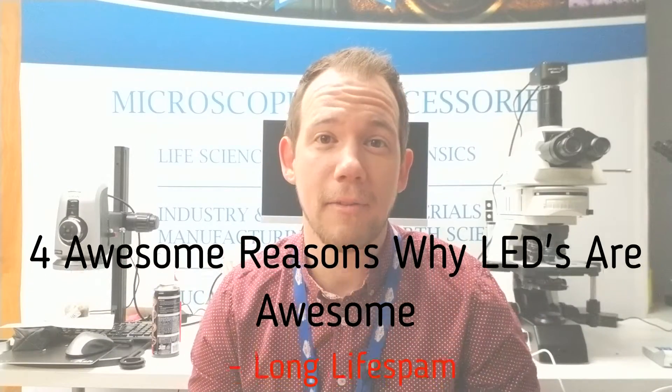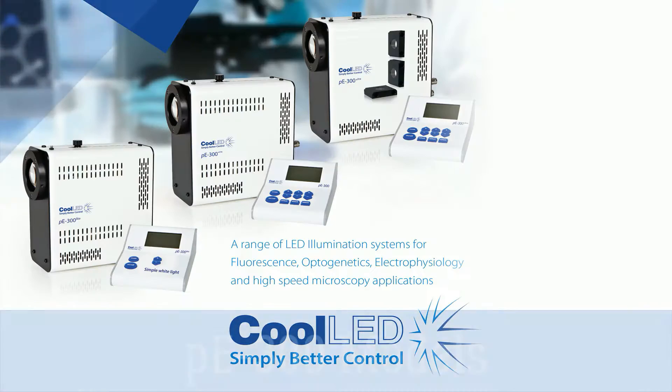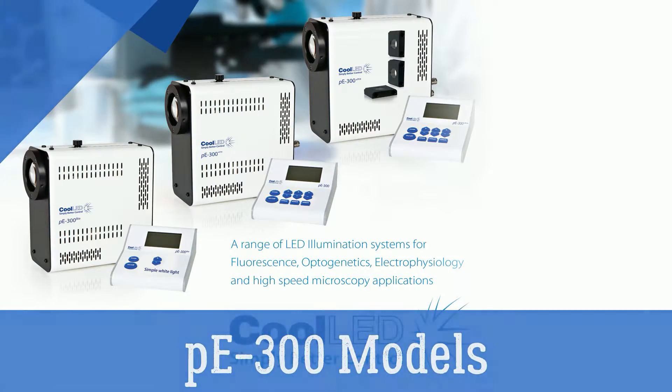Reason number three: it's environmentally friendly. Mercury and metal halide systems both contain mercury. It's also environmentally friendly from a power consumption point of view, because the PE 300 only uses 46 watts of power at full intensity — go green or go home. Reason number four: LEDs are cool. Mercury and metal halide output a lot of heat that can be damaging to your live specimen, but LEDs operate at a cooler temperature.